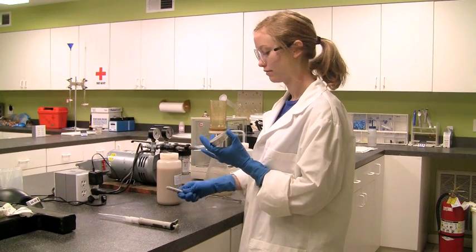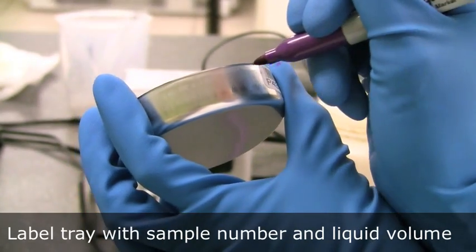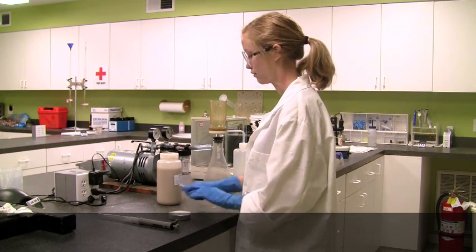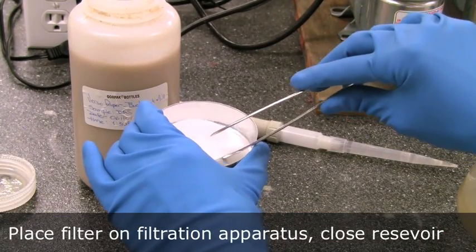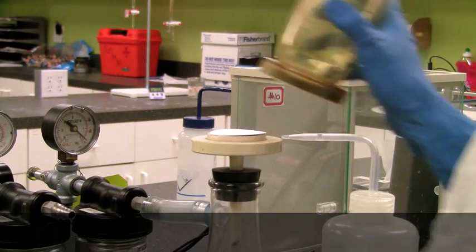Label the sample tray with the sample number and the volume of sample you are planning to use. Remove the filter apparatus reservoir and, using tweezers, pick up the filter and place it on the filter support. Do not touch the filter with your fingers.